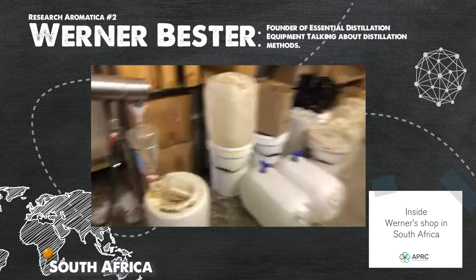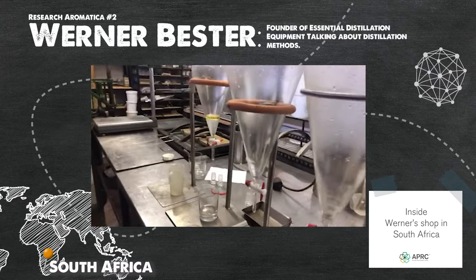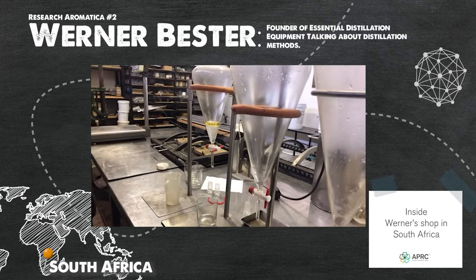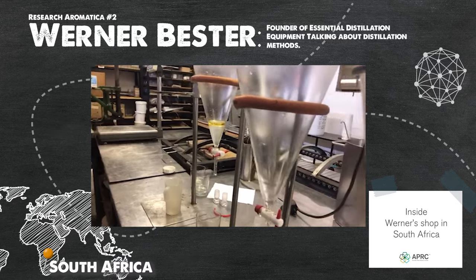If you look over here, you will see a sample we did previously. And there you can actually see the layer of oil on top of the water.